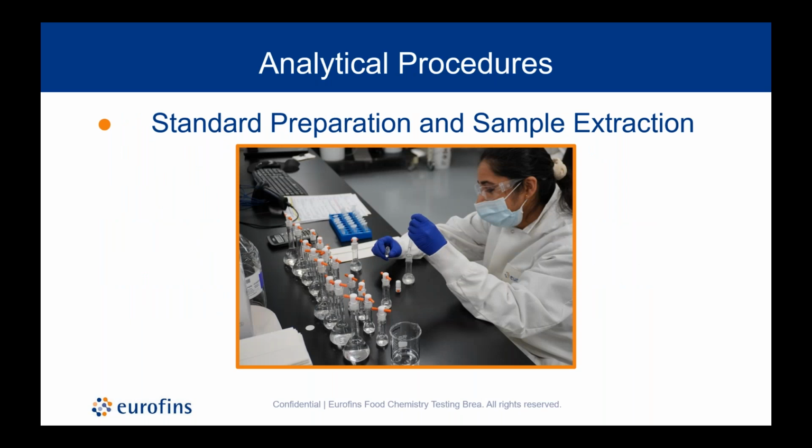So just a general, really simplified version of TLC, where the analytical process starts with preparing your standards and extracting your samples according to the method. Here we have one of our fine chemists preparing an array of reference standards at specific concentrations for various methods.